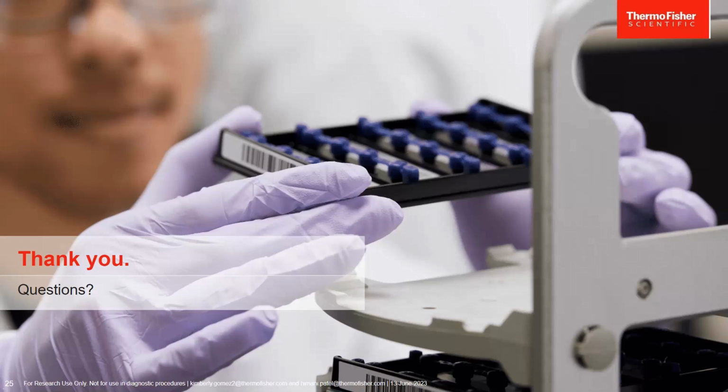Our first question is, can we leave samples in the auto run suite overnight without loss in data quality? So I can speak to that. We've done benchtop stability with our Absolute Q instrument, at least in terms of AAV samples. After they're lysed and sitting in the reaction mix, we don't see any loss of data quality for, I think, 96 hours. So you can definitely leave it overnight, even over the weekend if you really needed to.